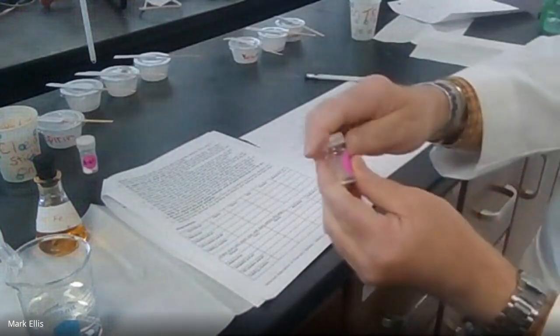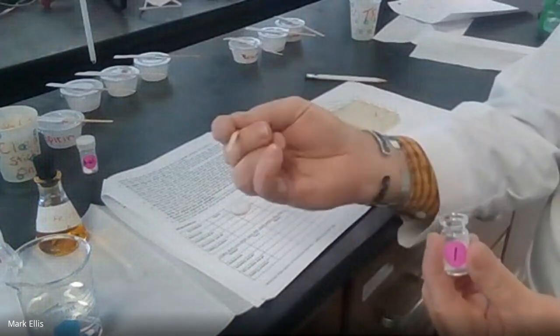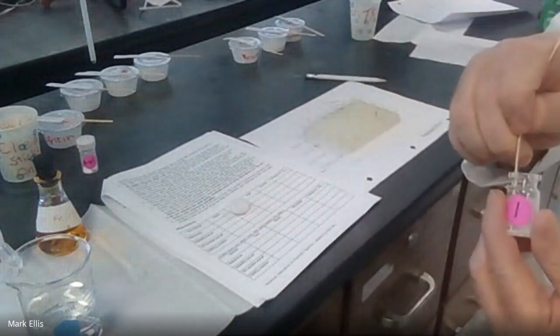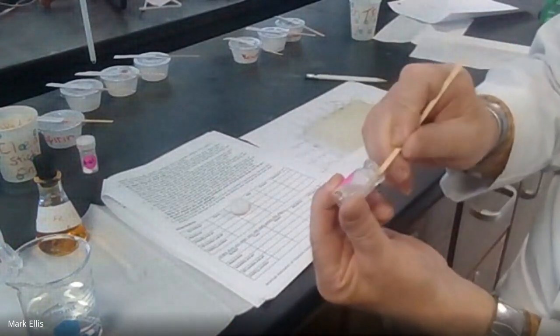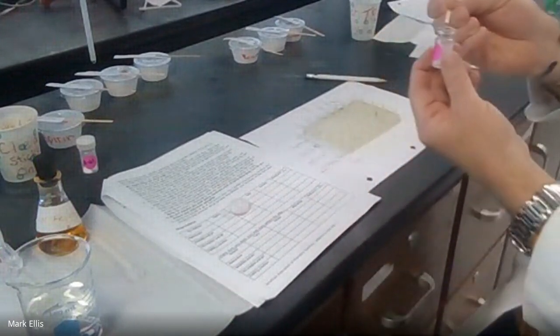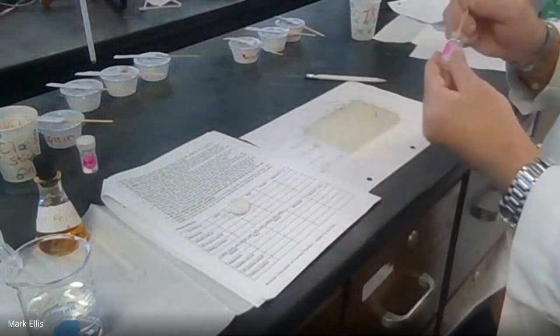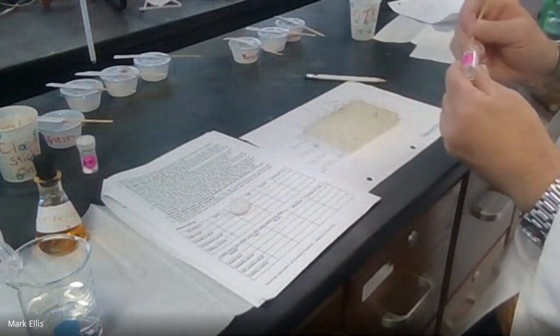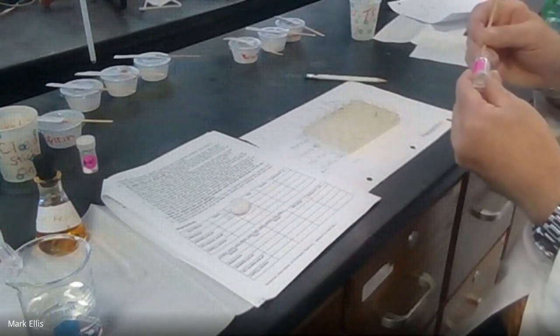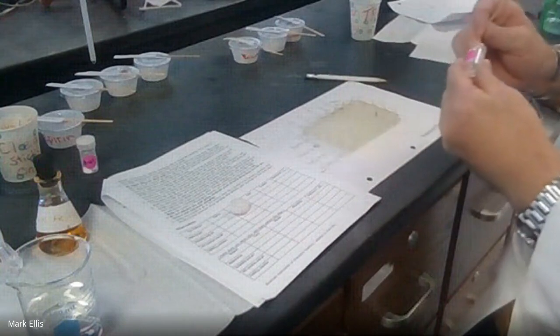Now we're using the unknown, which is for the pain relievers, which mine was number 1. I don't want to grab my antacid. I'm going to use a brand new clean coffee stirrer thing, and I'm going to take just a little bit out. I only need 4 little samples, so I don't need much. And that goes in each of the 5th ones. It's kind of hard to get out of there sometimes. So you have to pay attention.